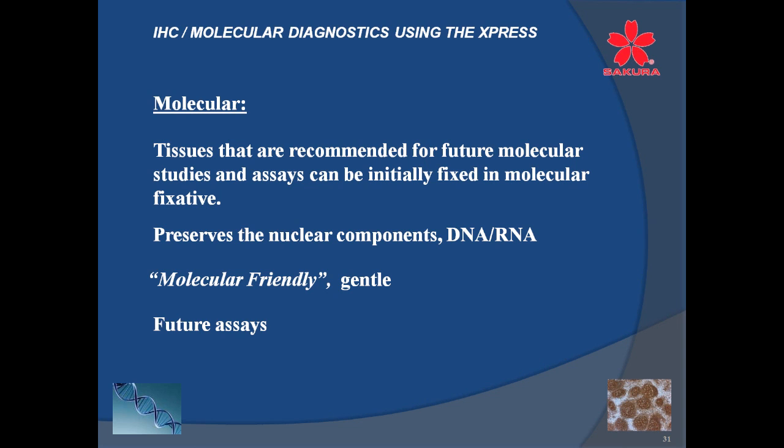So there are fixatives that are either being created or will be created to give us the fixation we need to preserve the nuclear components, RNA and DNA and other things. And it needs to be fairly gentle, as we may call it, molecular friendly, to do the work of these future assays. I see this coming a little more because of the research that's being done, and the tests that are now being offered through some of the molecular laboratories that have been springing up across the country. We all know they are, and they will continue to do that. They're going to want to see more and more detail than what they've been allowed to see in the past.